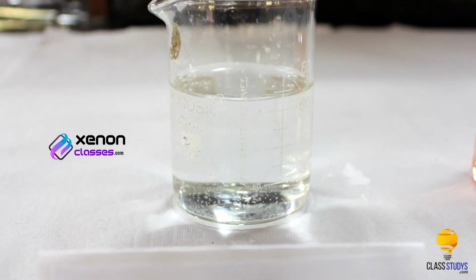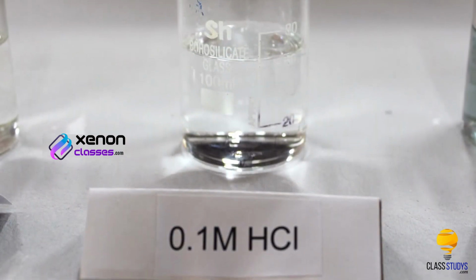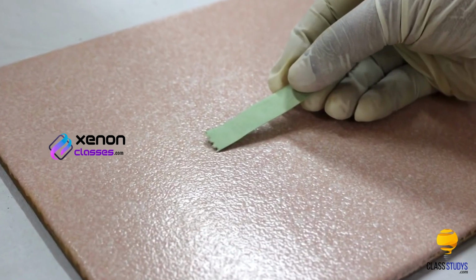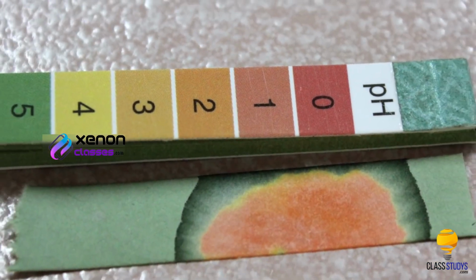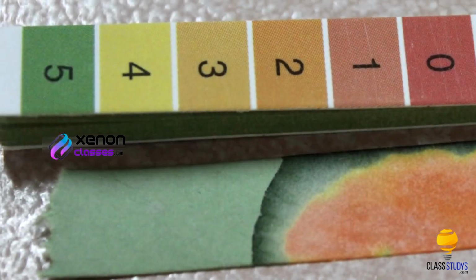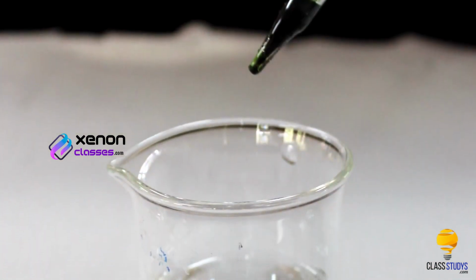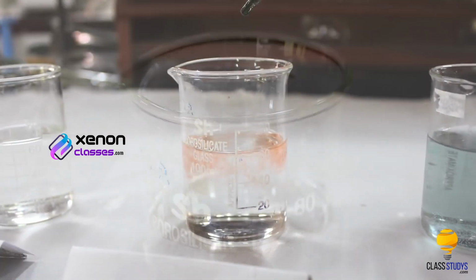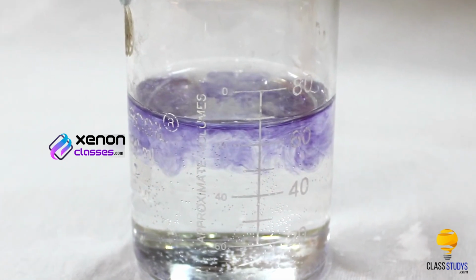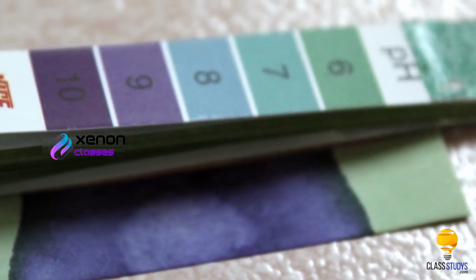Repeat the same step for finding the pH value of sodium bicarbonate solution and 0.1 molar HCl using fresh strips of pH paper, universal indicator, and separate fine droppers for every sample. Through these methods, we can determine the pH value of 0.1 molar HCl and pH value of sodium bicarbonate. The pH value of 0.1 molar HCl is 1 and that of sodium bicarbonate is 9.